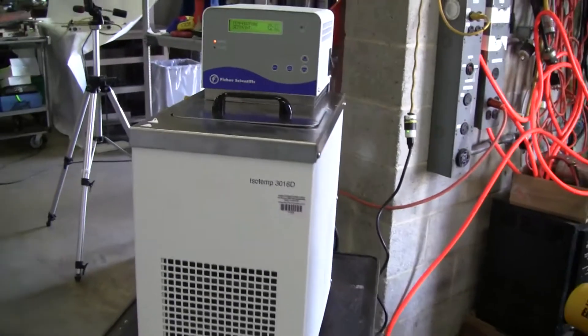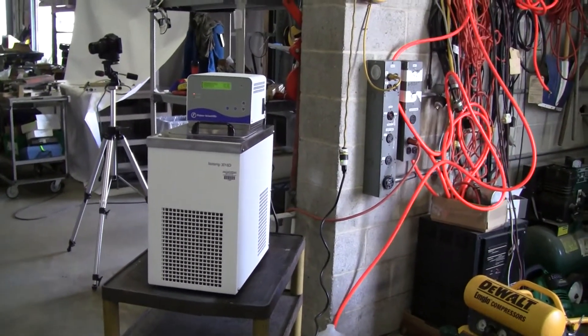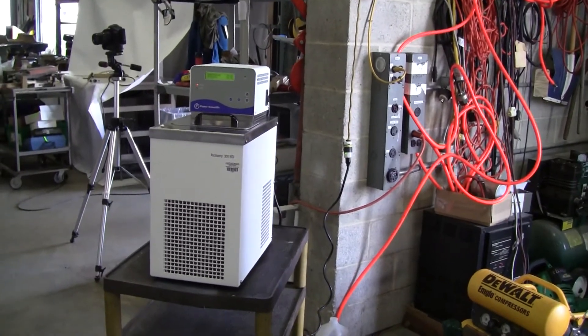Very nice machine. If you have any questions about this or any other item, please give us a call. 609-518-9100. Thank you from High Tech Trader.